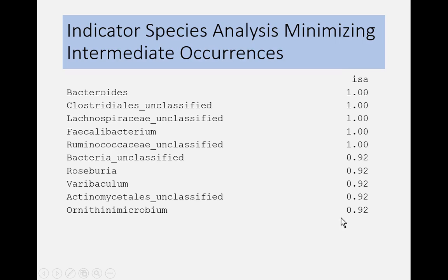I was just checking for the cyanobacteria, but I didn't put it in here. These are slightly more esoteric to interpret, and I tend to like the previous indicator species approach more. But it's just a different approach for making a kind of indicator species analysis.